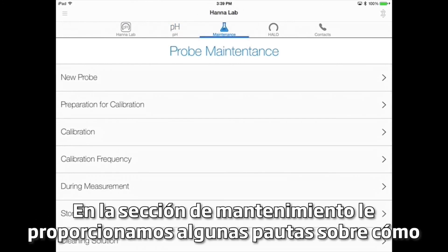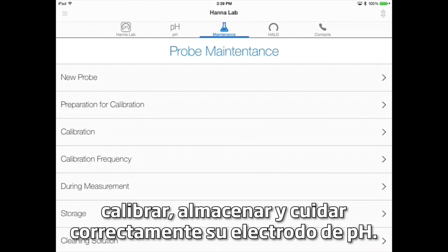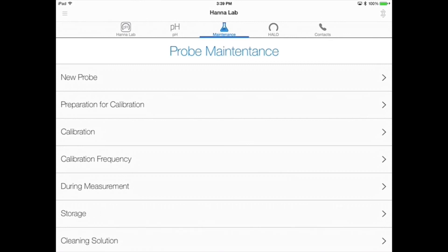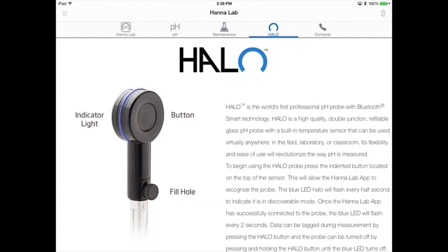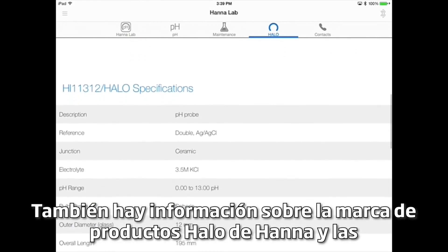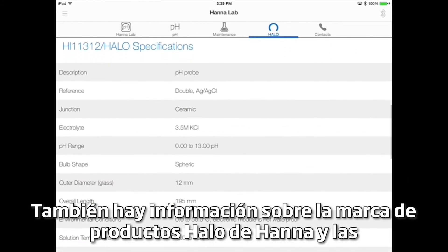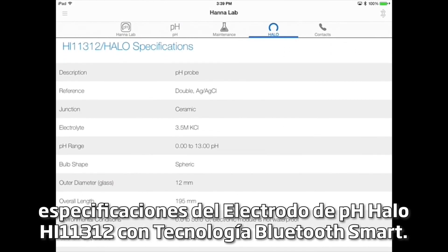In the maintenance section, we provide you with some guidelines on how to properly calibrate, store, and care for your pH electrode. Following these guidelines is important for repeatable and accurate results. There's also information about HANA's HALO brand of products and specifications for the HI11312 HALO pH electrode with Bluetooth smart technology.